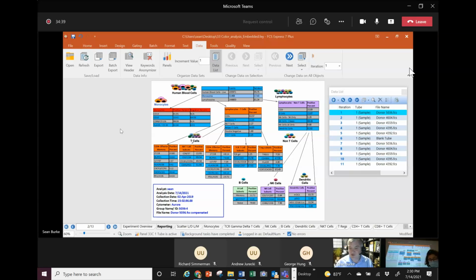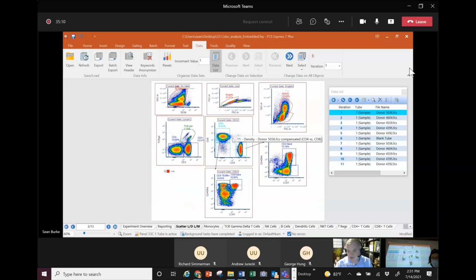Or if those values change, maybe you have cancer, maybe you have some other sickness in your immune system. And that's how flow cytometry is used in a clinical sense to make evaluations about what's going on in a patient's immune system. But just as well, you might be treating mice in the lab with a drug treatment, and you want to see what's going on in their immune system, right? It's not a clinical test; it's a research test, and these tools are really helpful and functional for that. So that's a little bit about how we get to this data.